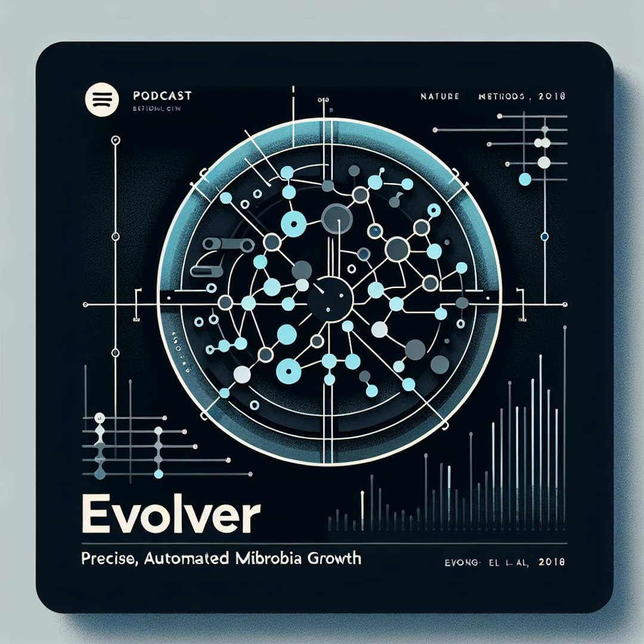The modularity is key. It means that eVOLVER isn't a single, monolithic device, but rather a collection of independent, interchangeable components. This allows for incredible flexibility and customization. I see. So, you can essentially tailor the system to whatever experiment you're doing, rather than being constrained by a fixed setup. This is a big advantage over many previous automated systems. Exactly. Let's talk about these three main modules: the smart sleeves, the fluidic module, and the control system.